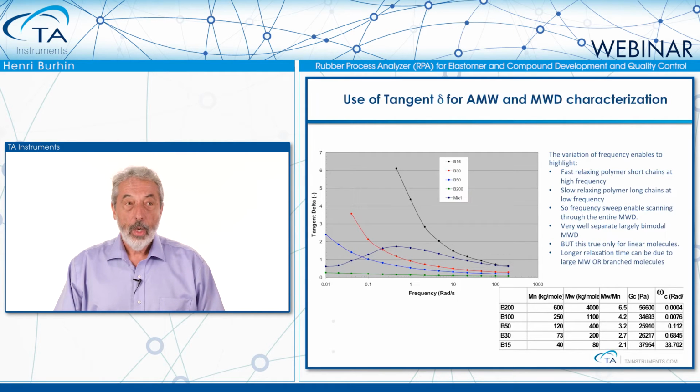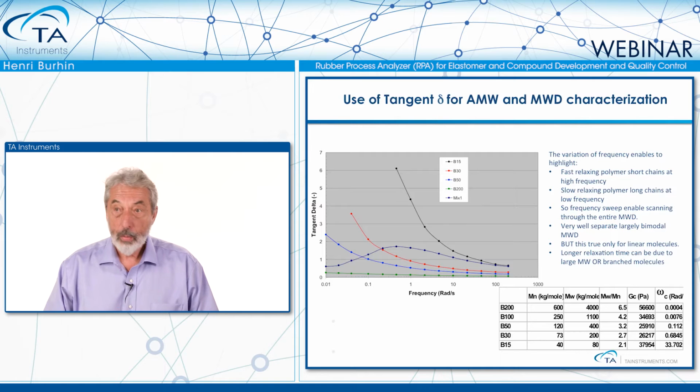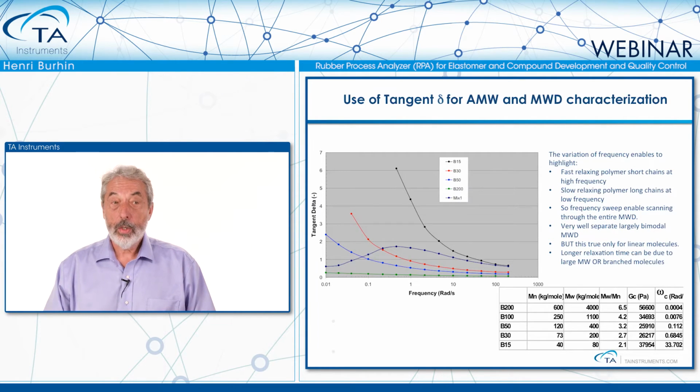The further you increase molecular weight, the more the tangent delta curve decreases, until you go to the very high molecular weight of up to 4 million Dalton, which is the green curve, where actually it's flat. It behaves like a solid. Now you can understand that the delta or tangent delta will not work in this case, because the high viscosity would suggest a more branched polymer, but we know it is impossible in PIB.